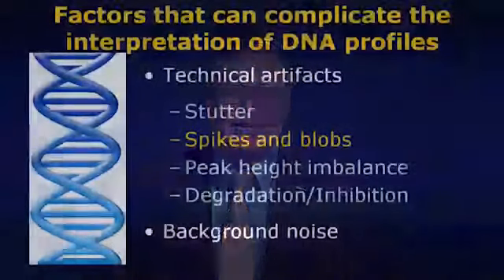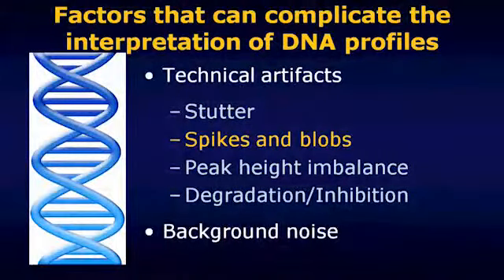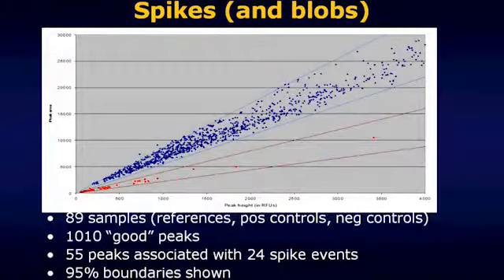Let's talk now about spikes and blobs. I'm sure everybody's heard of the attack of the blob. Well, blobs manifest themselves on DNA profiles as well. They're relatively uncommon, but nonetheless something that DNA analysts recognize readily. Here's what's going on with a spike and a blob.